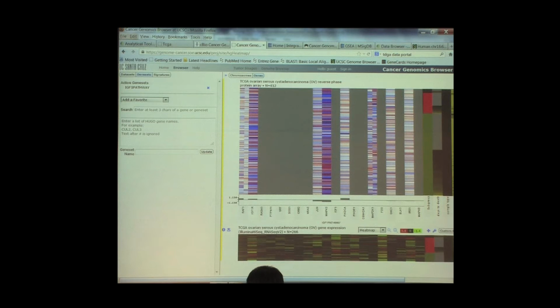And it's gone through here, and it's given you statistics here. So it's actually telling you where there are differences between the subsets. And the fact that these are gray means that they don't actually qualify as being statistically significant in one subset or the other.